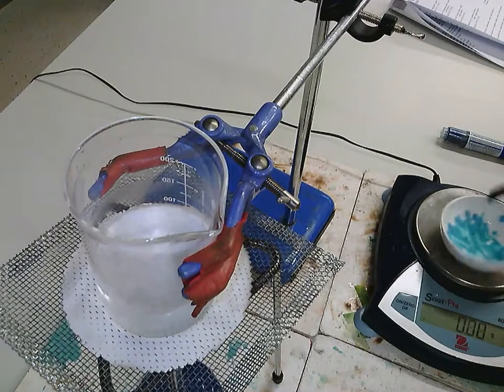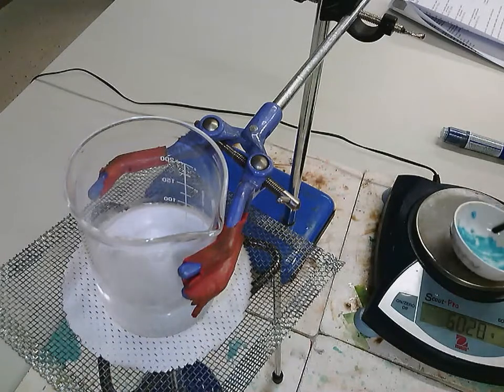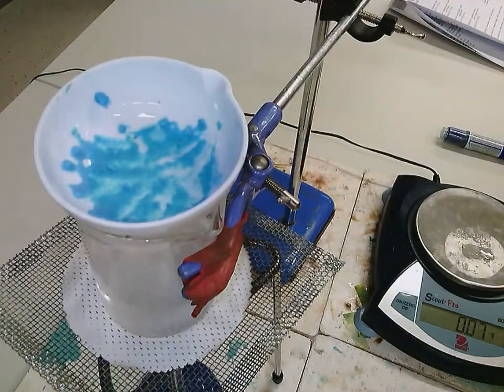Put it here. So you can see at the moment it is 60.23 grams. So I'll put it back on. I'm going to leave it a minute and I'm going to take the weight again, and I'm going to keep doing that until it no longer changes.